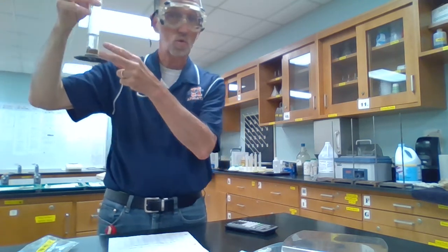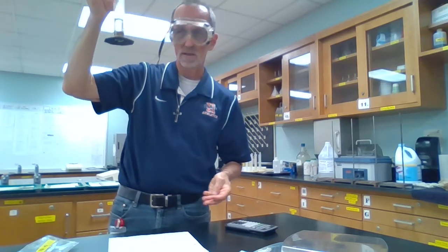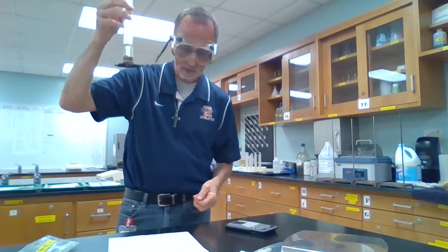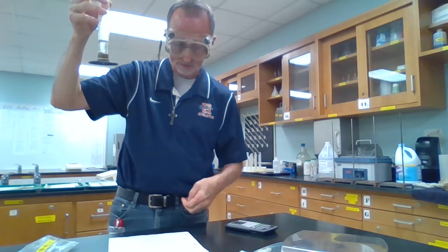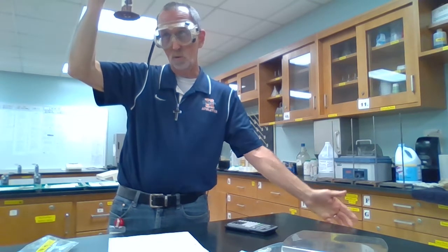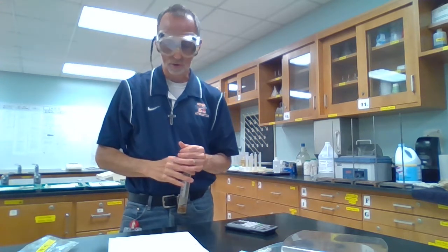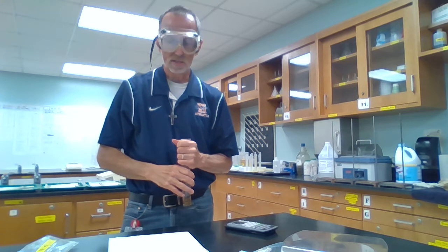So I originally started with 20.0, and then I just gone up from there. So it makes it pretty easy to read since I started on a whole number that ended with 0. So anyway, 9 pennies was 3.0 mLs, and finally I'll put the last 4 in to get us to 13. And we are now at 24.5, so that would be 4.5 mLs for 13 pennies volume. Okay, so we got all the masses and all the volumes of our pre-82 pennies, which were set A.